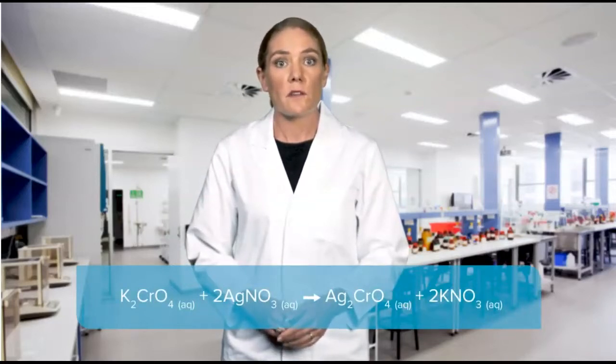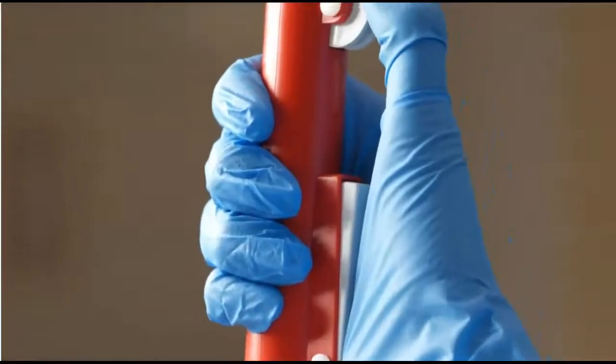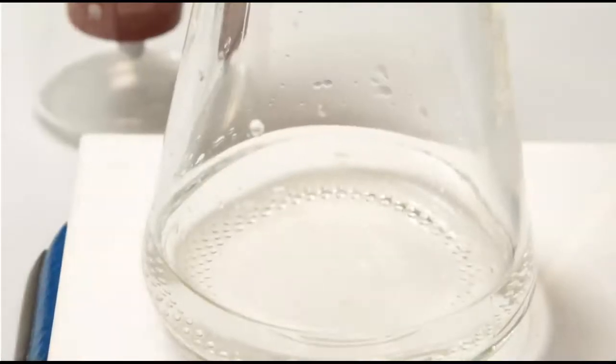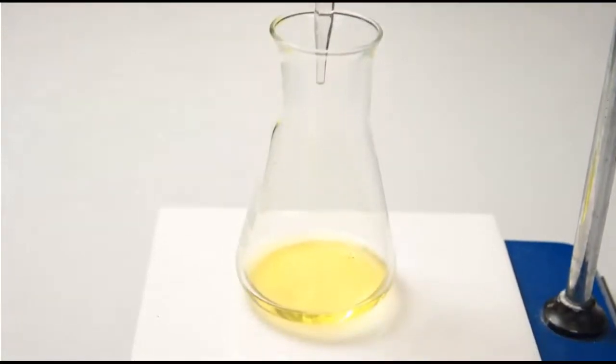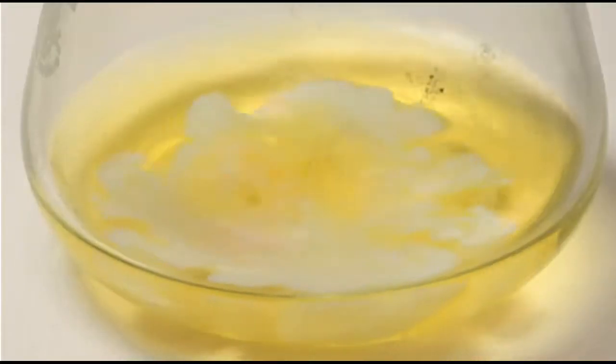By determining the volume of silver nitrate needed to completely react with the chloride ions in the conical flask when the colour change occurs, the concentration of chloride ions in the seawater sample can be determined. To determine the concentration of chloride ions in seawater via precipitation titration, a 10.00 mL aliquot of the seawater sample is placed in a 250 mL conical flask. 1 mL of the indicator, potassium chromate, is added. The burette is rinsed and filled with 0.2001 molar silver nitrate solution.